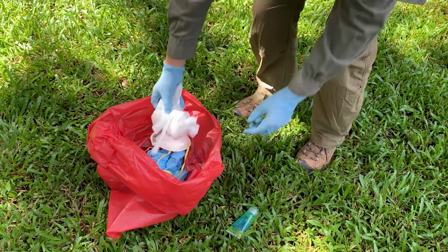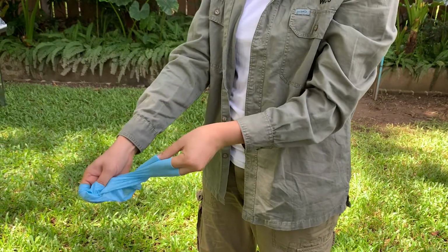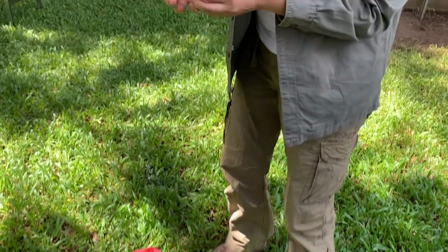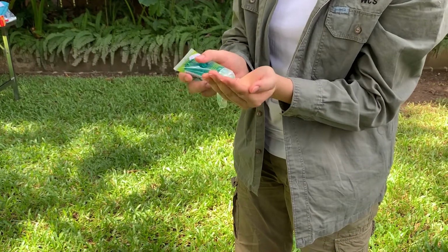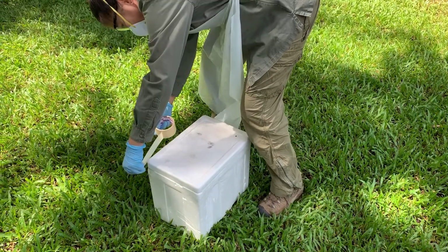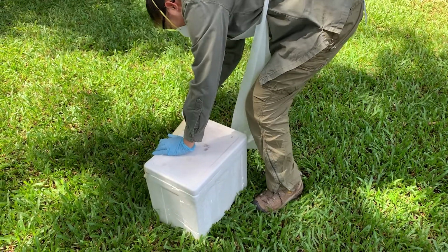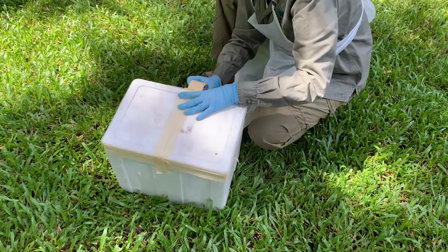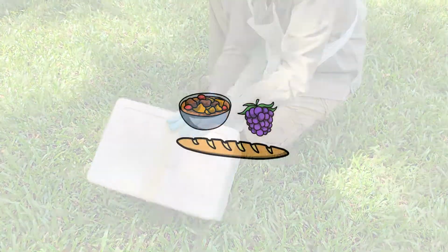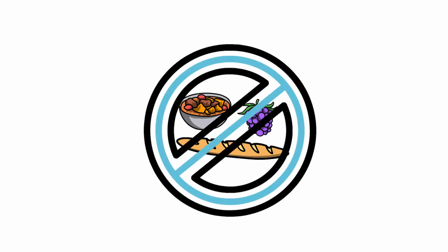After you have collected your samples, be sure to properly dispose of your protective equipment and get instructions from your supervisor about carcass disposal. Put all your samples in a designated cold box, fridge, or freezer as soon as possible after collection, and inform your focal point for wildlife health surveillance. Do not store samples in proximity to food items.